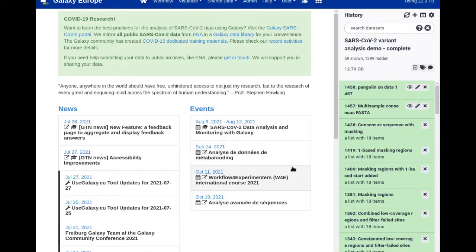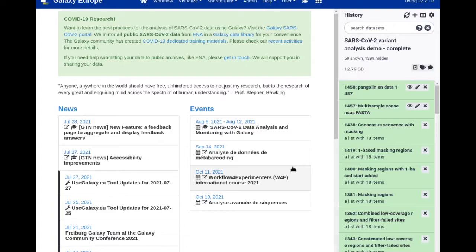An issue people often face once they have finished their first real-world data analyses with Galaxy is how to retrieve key results files efficiently for further use or storage outside of Galaxy.